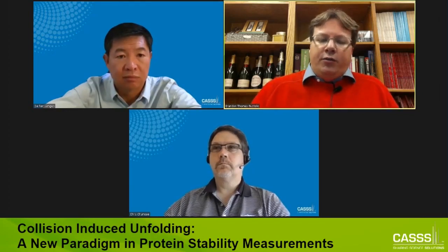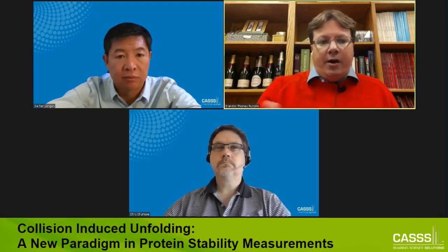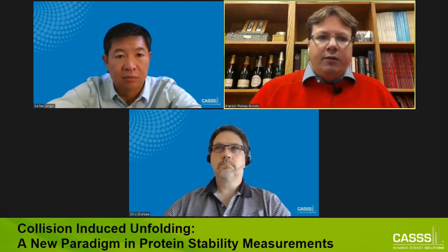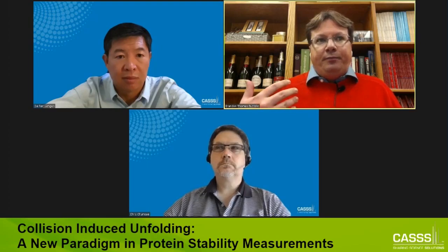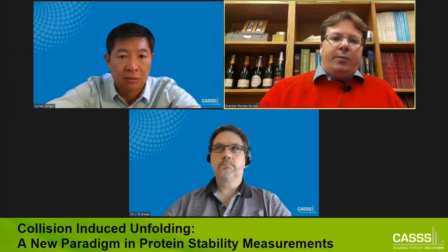The key thing to do, I think, in comparing CIU data is to make sure that charge is a fixed value. It's not a variable in the context of the experiment. So if you compare across antibodies, for example, or across replicates, you're always comparing the same charge state, to make sure that those charge-based differences are not tripping you up. But in many cases, we would opt to look at the lowest possible charge states in our experiments in order to minimize any charge-based aberration of structure.